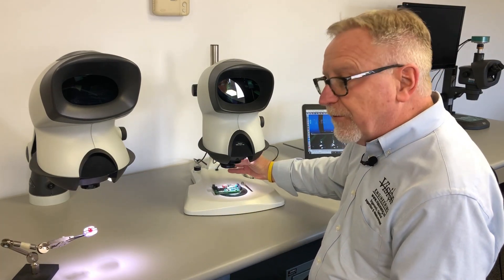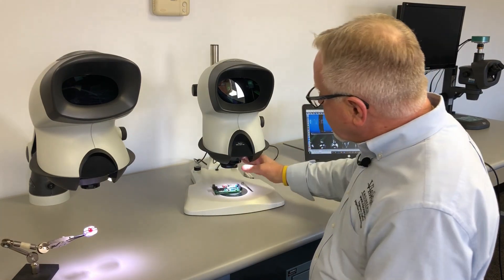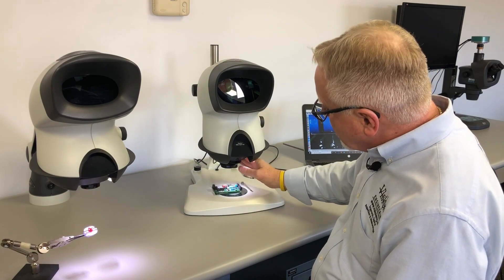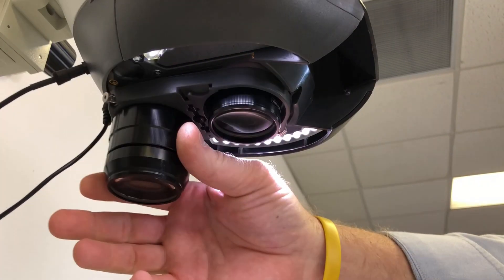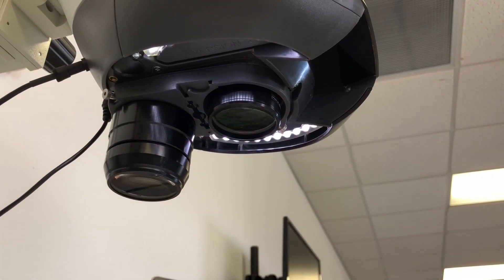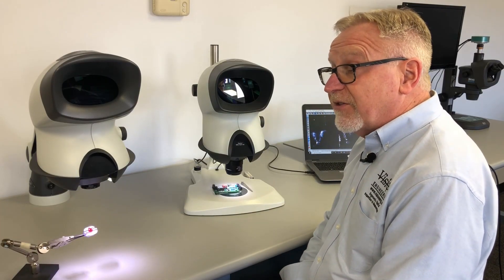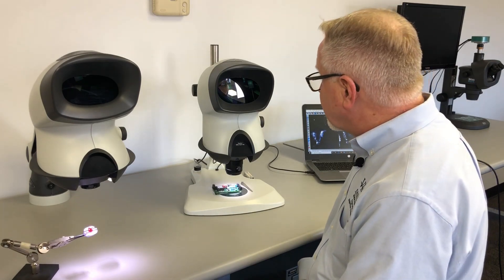In this instance, we have a 4x and a 10x in there. At 4x we have great working distance and a large field of view to the scope of about an inch. We can easily take that and flip it right up to 10 times magnification. 4x and 8x or 4x and 10x are by far the most popular choices with the Mantis Elite.